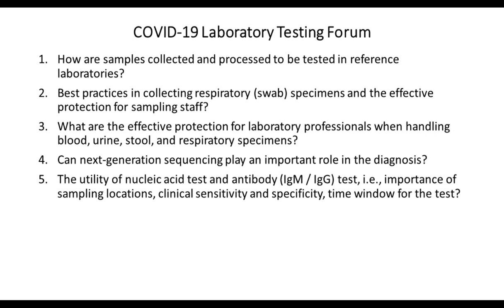All the samples we are operating on here were inactivated at 56 degrees centigrade for 30 minutes before operation. That will make the virus inactivated, so it must be safer. And all the samples should be prepared in a biological safety cabinet. The biological safety cabinet is the most important equipment here. We all use a B2 level cabinet here. I suggest you check the wind direction of the cabinet before and during using it. Here we stick a little piece of paper to the edge of the glass to observe the wind direction. So maybe it's a good method for you too.